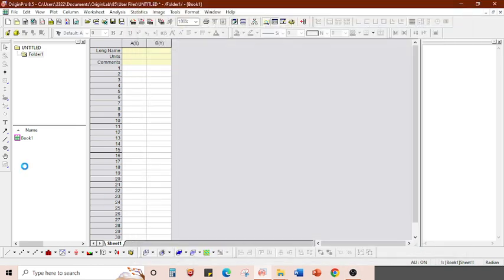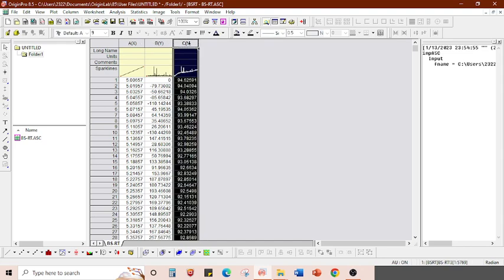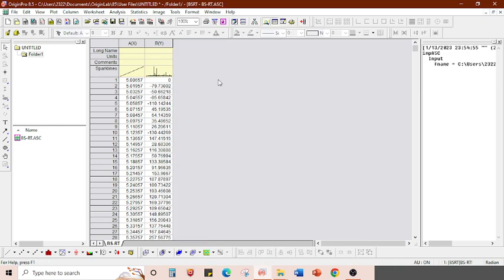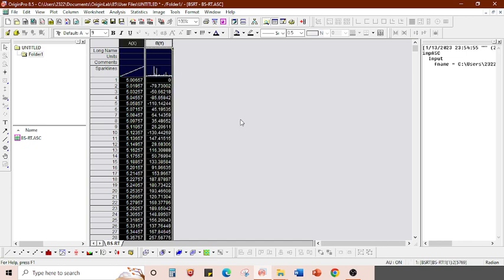So you give Open, and it opens the reading. Usually you get only two columns, A and B, which are X and Y. The second is the data which I have, so I'm going to delete it now. This is the unusual data we have. In this, the X column represents the 2 theta value, and the Y is the intensity. As usual, I'm going to select it: click the left button, go here, and when you get an arrow, click, press Control, and select one more. So you're getting it selected.